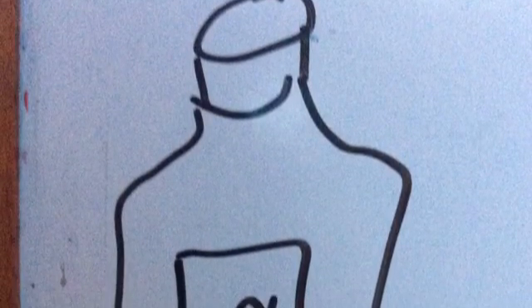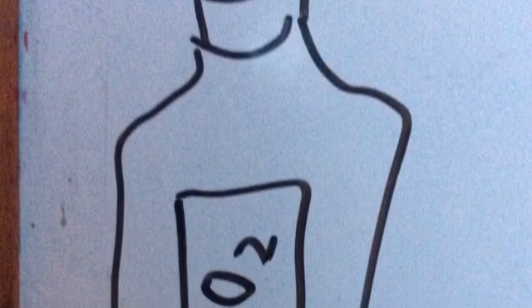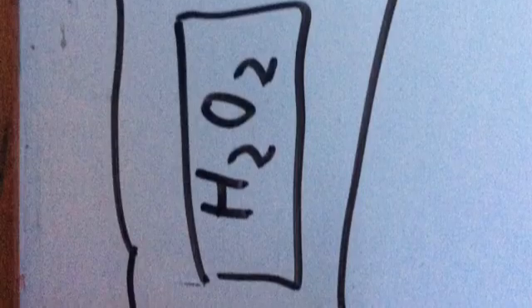Welcome to AP Chem's 5th lab of the year. This is the hydrogen peroxide lab where your objective will be to determine the percentage of hydrogen peroxide in a drugstore bottle. To do this, we will be using the technique of redox titration.